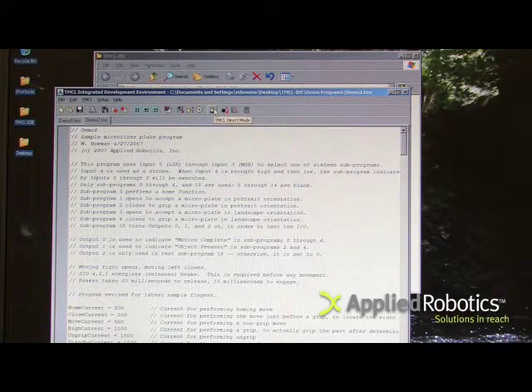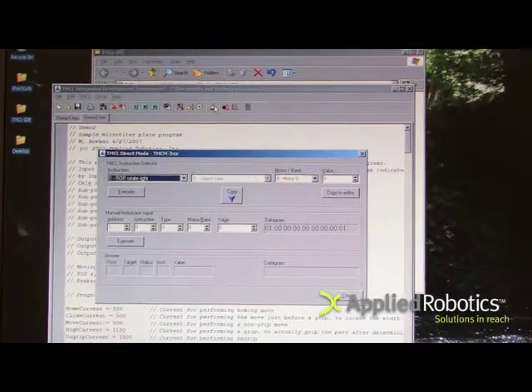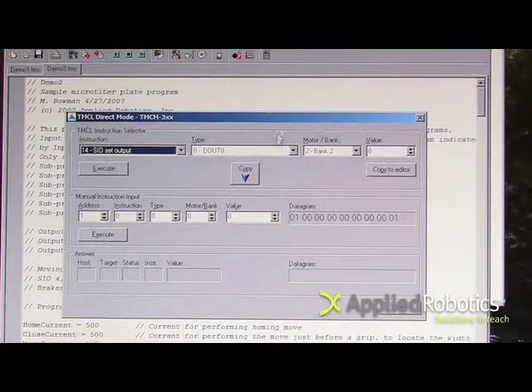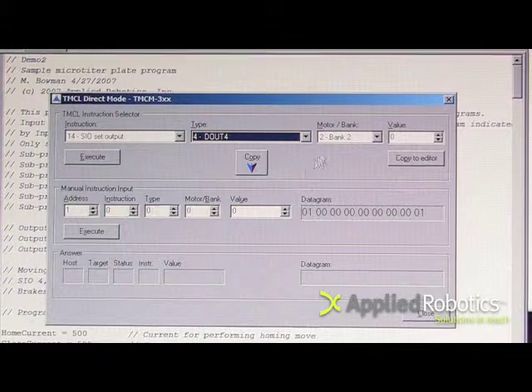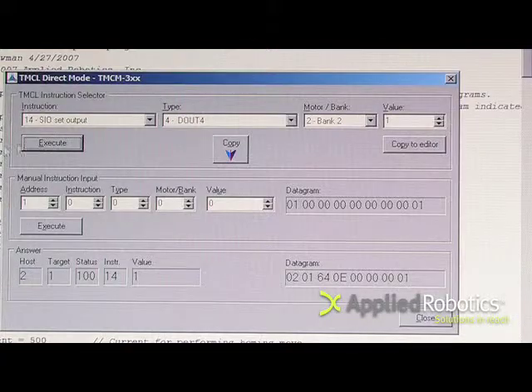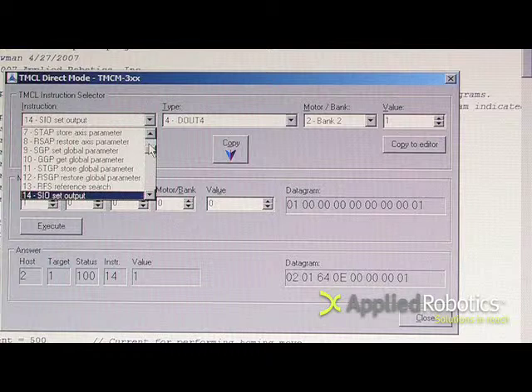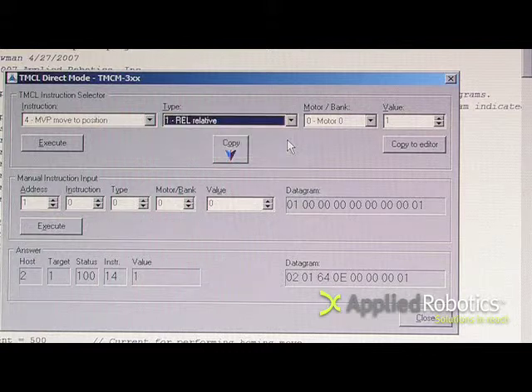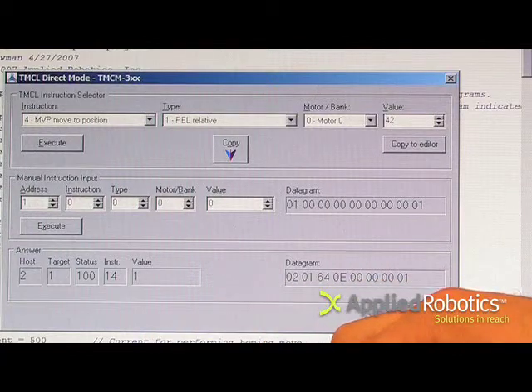I can also send commands to the smart gripper using the direct mode by using TMCL direct or the direct mode icon. Using the set output command, select output 4, bank 2, value of 1. Press execute and that energizes the brake, releasing the brake. Then using the move to position command, relative motor 0, and a value of 4,275 represents 10 millimeters.